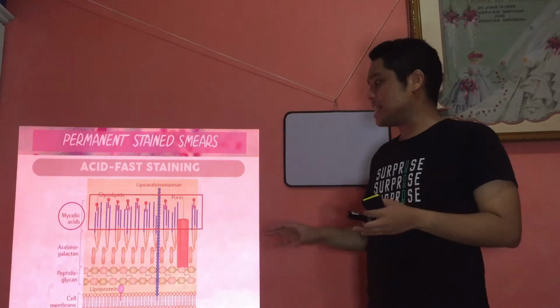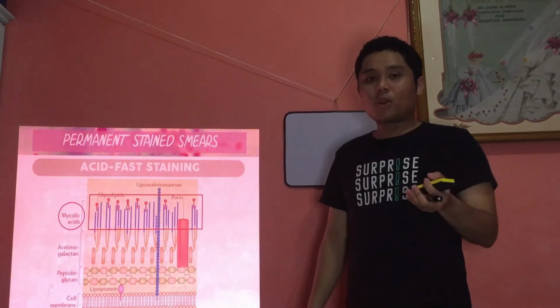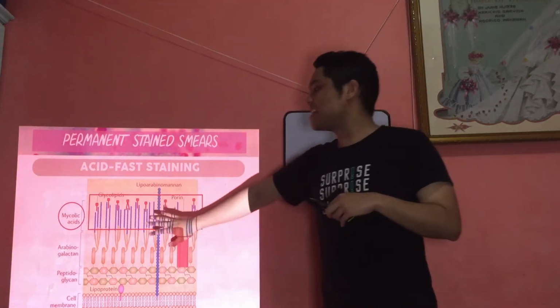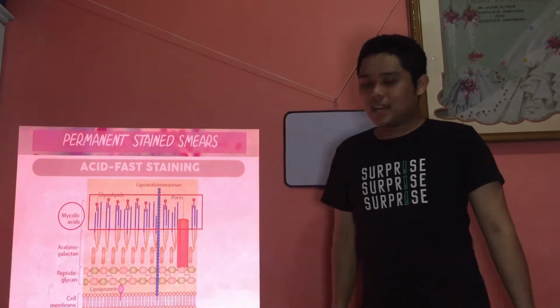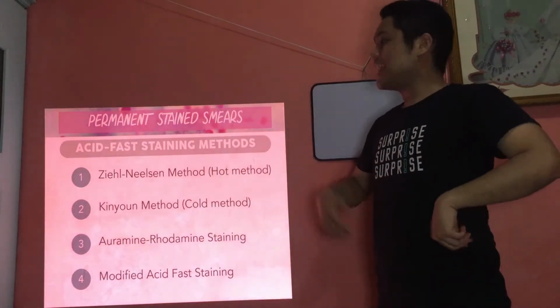But for acid-fast staining, this is what we are looking at. The mycolic acids. So the non-acid-fast organisms don't have this part. I think they only go up to here. Okay, alright. So these are the mycolic acids, again, long-chain fatty acids. Now let's go to the different methods in acid-fast staining.